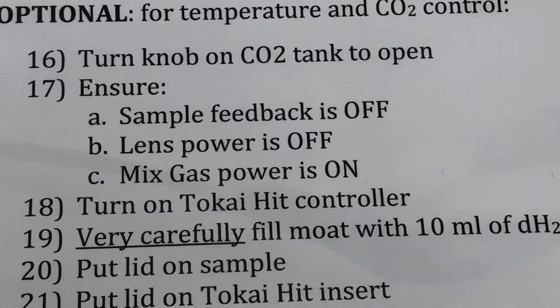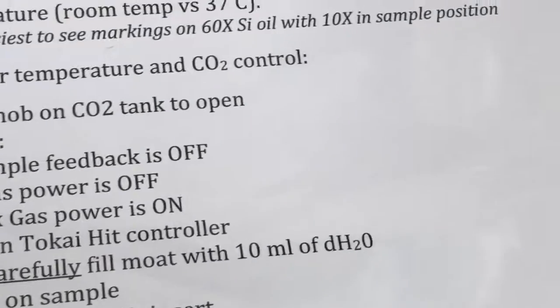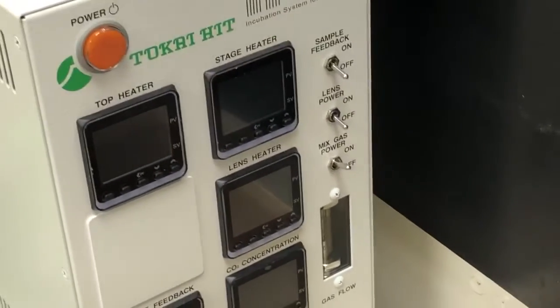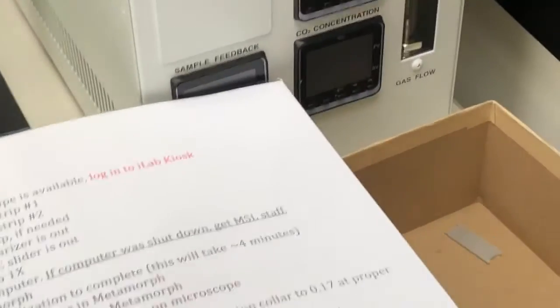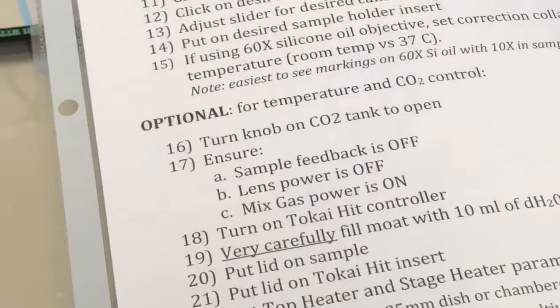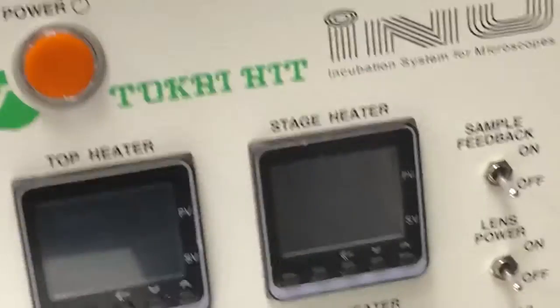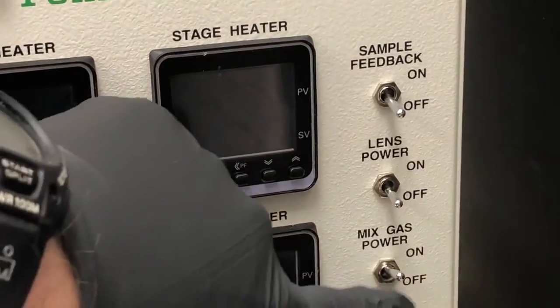Step 17: ensure sample feedback is off, lens power is off, and mixed gas power is on. That refers to the Takai Hit controller which is here. So we want sample feedback off, lens power off, mixed gas power on.